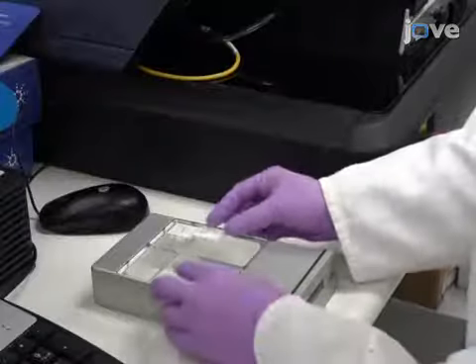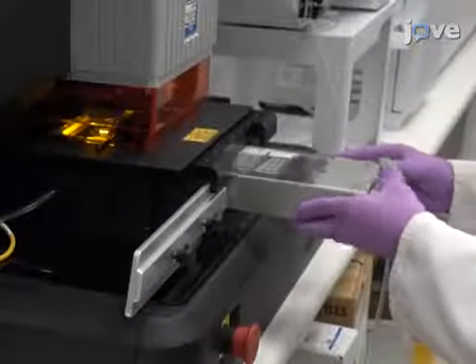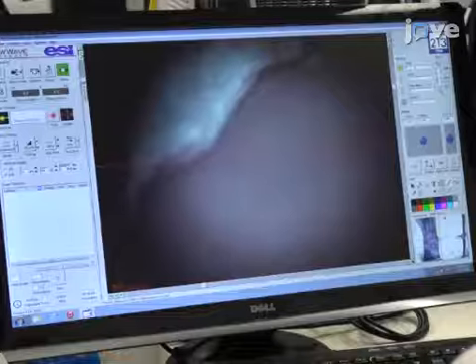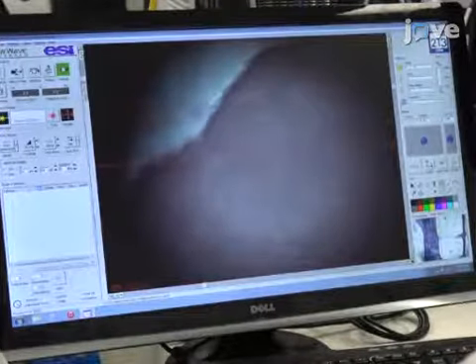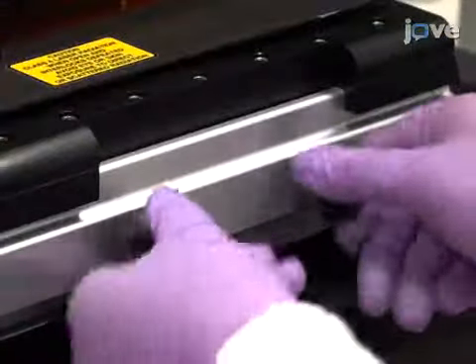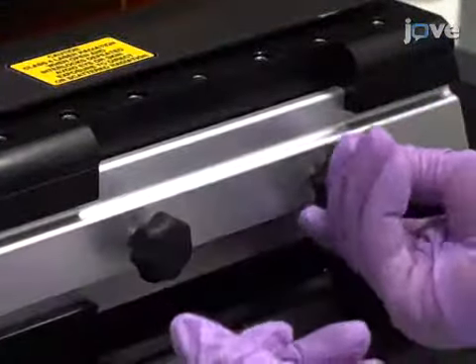First, place a brain tissue sample and all matrix-matched tissue standards in the laser ablation chamber. Ensure that the samples are within the LA-CCD camera depth of field. Close the chamber door and finger tighten the screws.